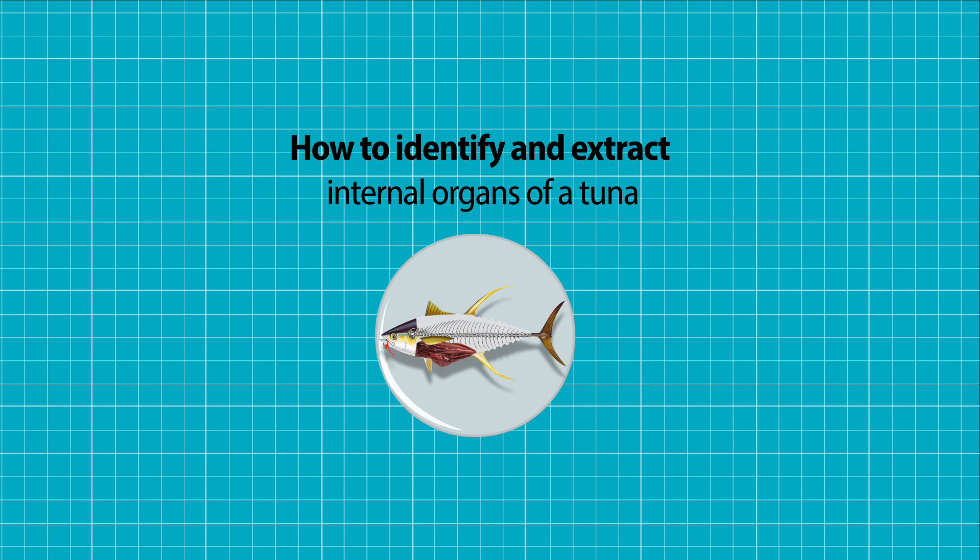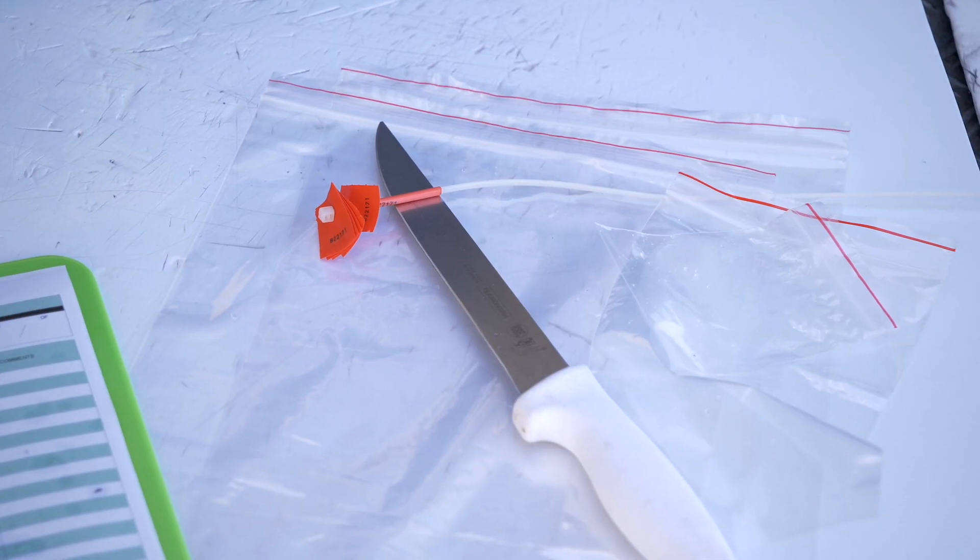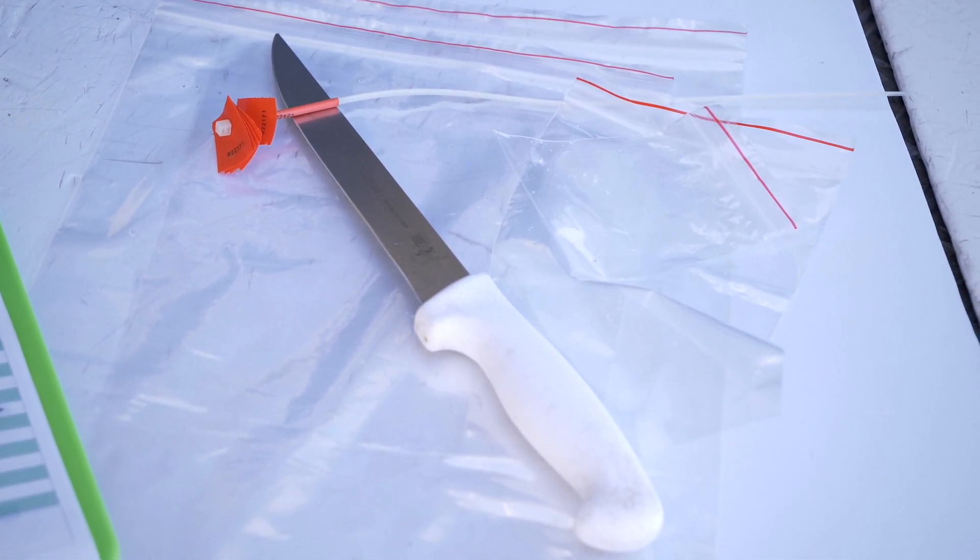Today we're going to learn how to identify and extract internal organs of tuna. We're going to need a knife, plastic bags, labels, and gloves.